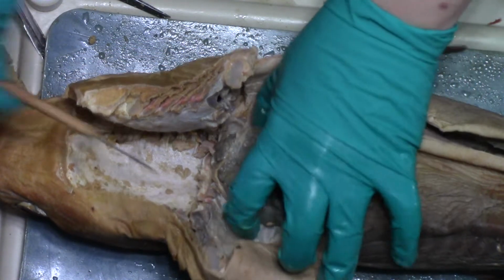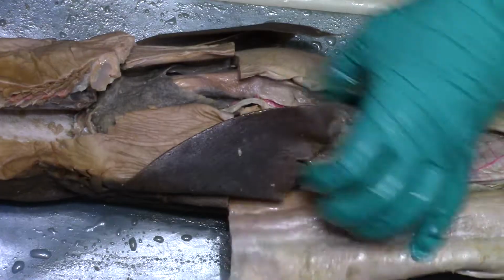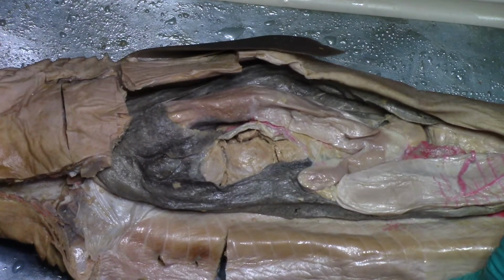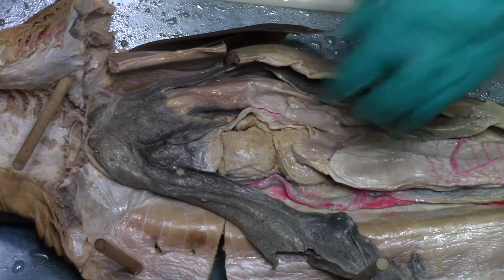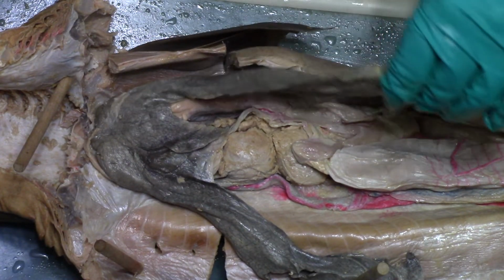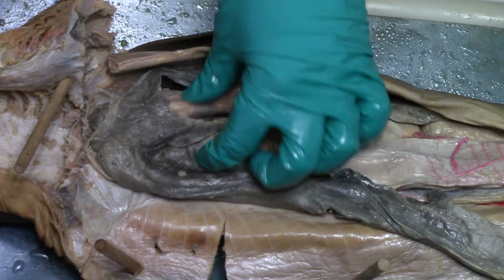And then the stomach I was talking about is back up here, but there's a bunch of other organs that we should probably talk about first. So if I use some of my probes here. So we've got these two big gray things, are the liver. Liver is a super important organ. It's usually really big and really easy to find.